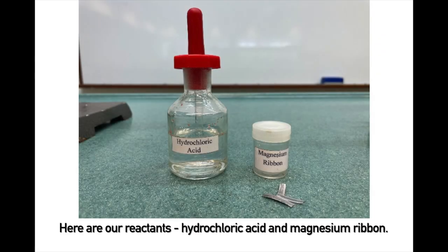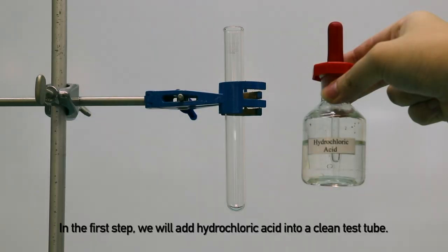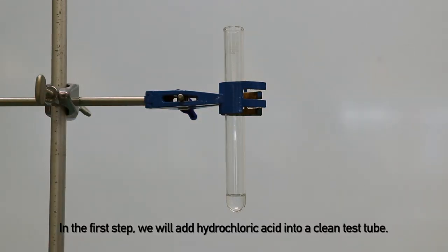Here are our reactants, hydrochloric acid and magnesium ribbon. In the first step, we will add hydrochloric acid into a clean test tube.